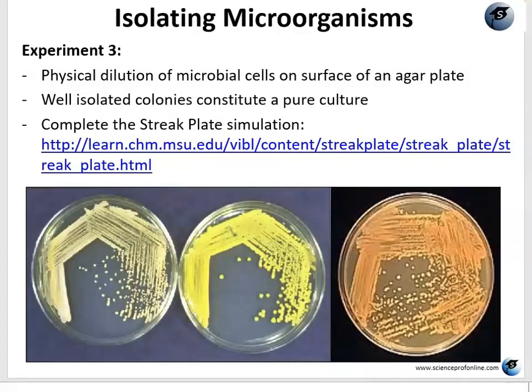Experiment 3, you're going to be doing a streak plate in order to isolate colonies of Saccharomyces cerevisiae yeast. And I've also provided a simulation here so that you can go through the steps of streaking for isolation at home and perhaps while you're preparing for the quiz. I do recommend performing the simulation before coming to the lab.